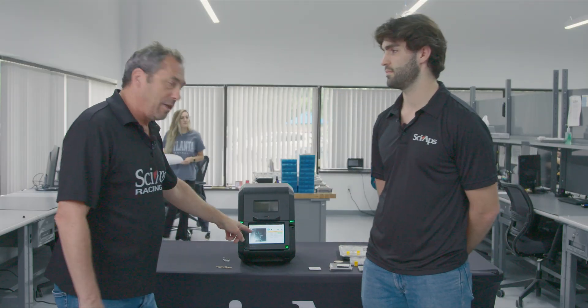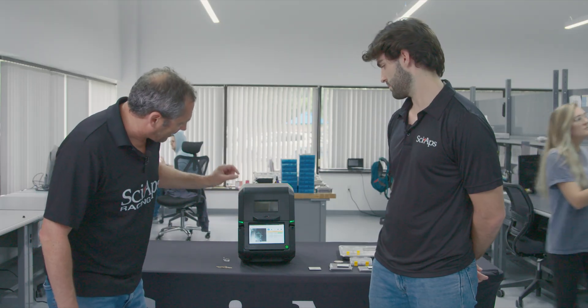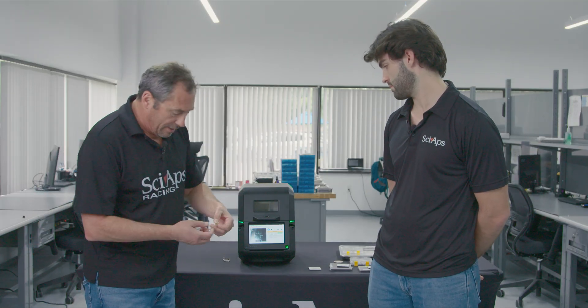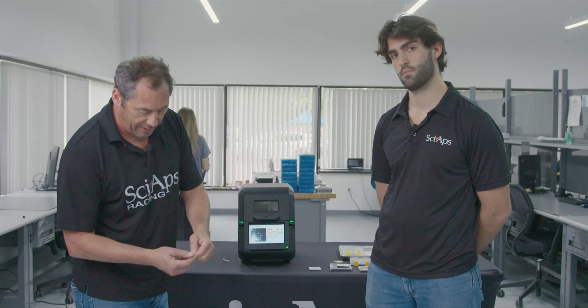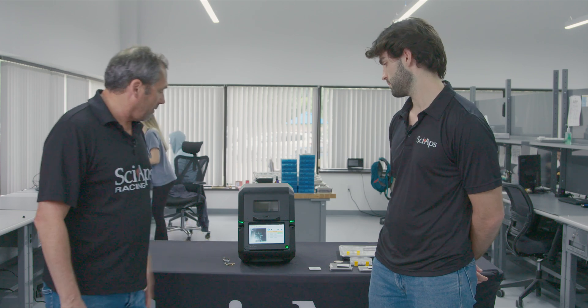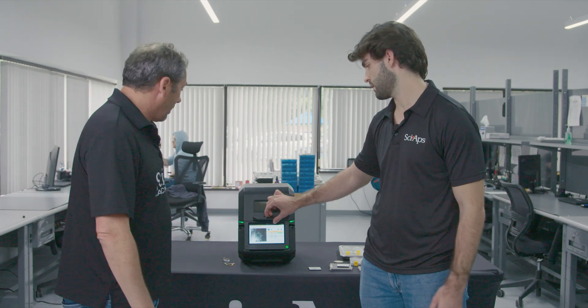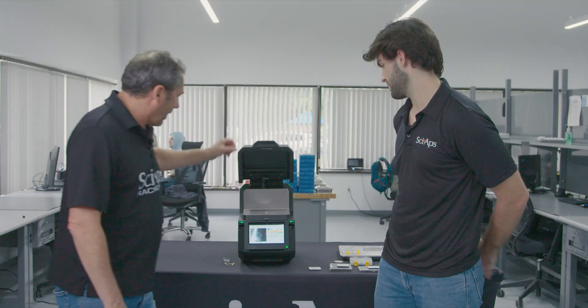Collimated beam down to three millimeters, and a targeting scope so you know where your beam's hitting on the material. If you're doing something like this and you just want to hit one of the links, or just one part of it, you'll know that. It's also got plating alert. Do you want to show off some scans? Yeah, let's do some scans.